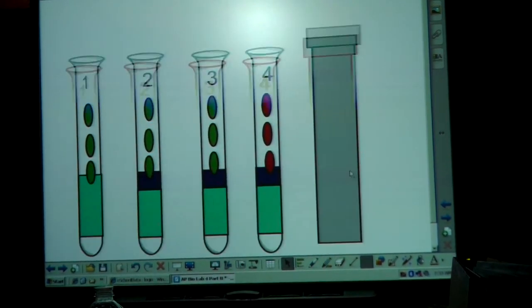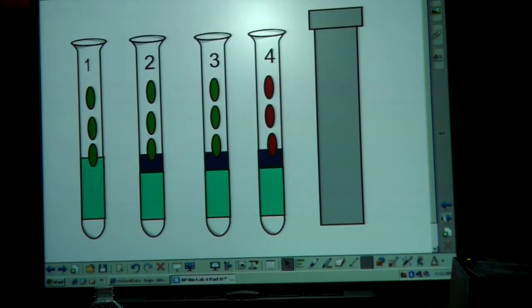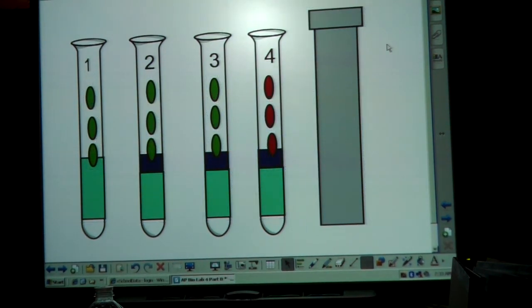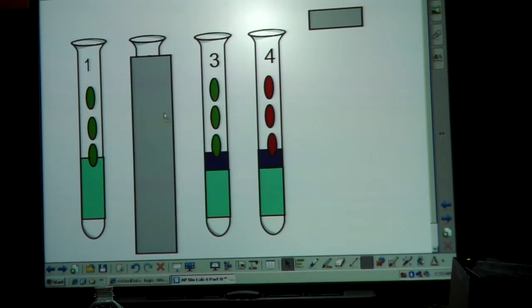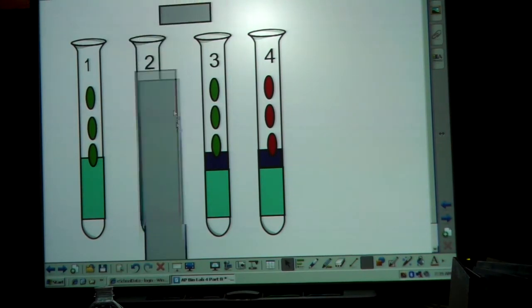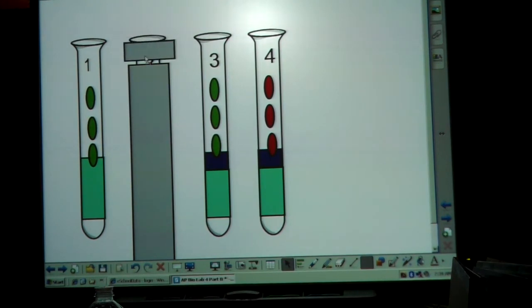Okay, then we have our aluminum foil here. So if you can create something that goes right over the top of number two with a cap of aluminum foil, you want to make sure that light's not getting in anywhere. And you don't want to wrap this super tight around it because you're going to need to be able to pull the test tube out and slide it back in. So if you can do something where you can easily remove the foil, put it back on, that's what you want to do.